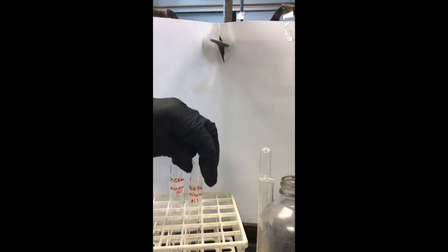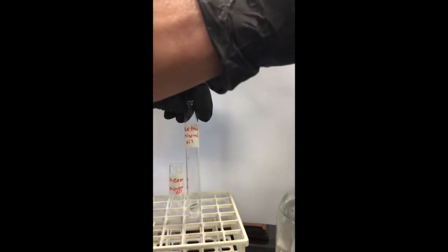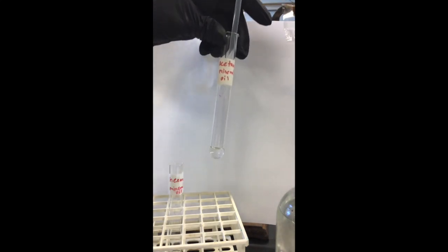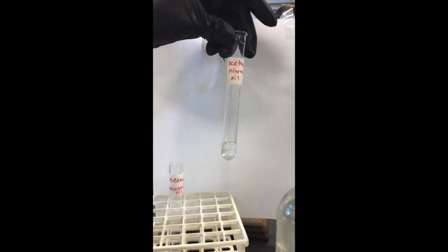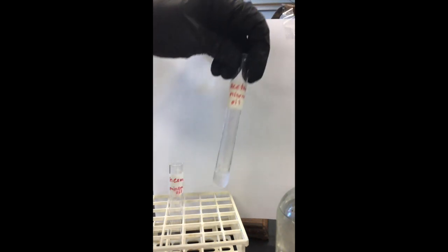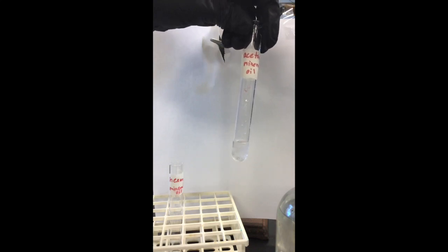The next sample we have is acetone and mineral oil. So here's our mineral oil. We'll let this one sit for just a moment.